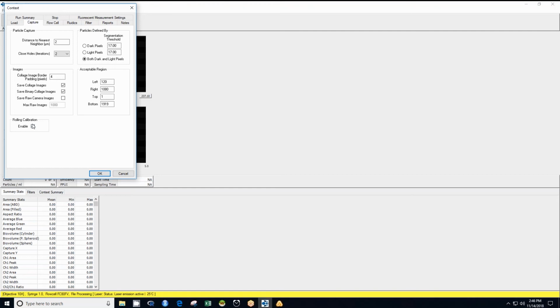If you want to select this value and change the number of continuous frames that are used in the calibration image, hold the Shift key and left mouse click over Enable, and a hidden menu is displayed. You can increase or decrease the frame count. You can choose to select or not select this setting.